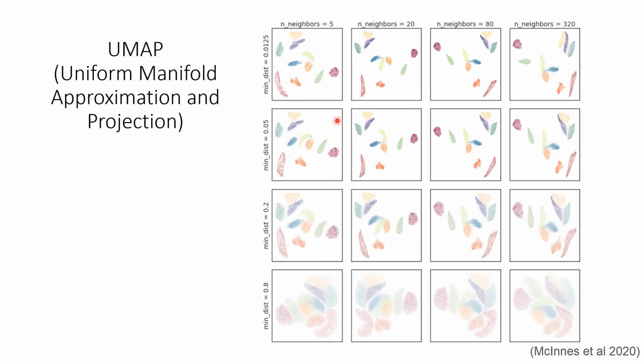So instead, what people do is reduce the 20-dimensional coordinate points down into two, an X and Y coordinate system determined by UMAP or t-SNE. And so each dot here represents a cell and all of its genes collapsed into 2D space.